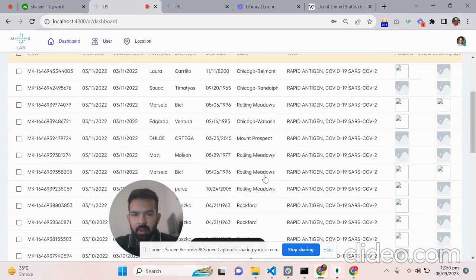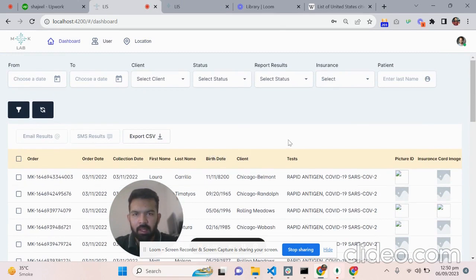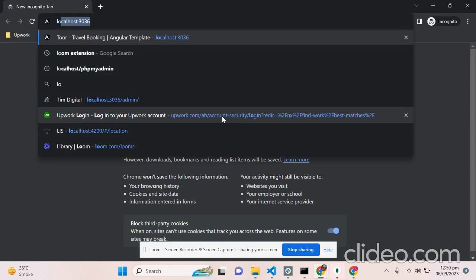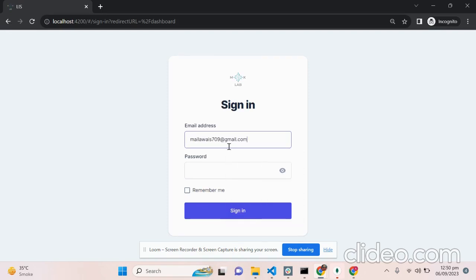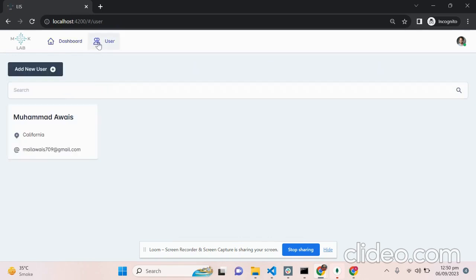For the super admin, the records of all the locations are showing up, but let's log in as the newly created user. Let me access this one. This is the new user we have created. The password was this one. Let's sign in.